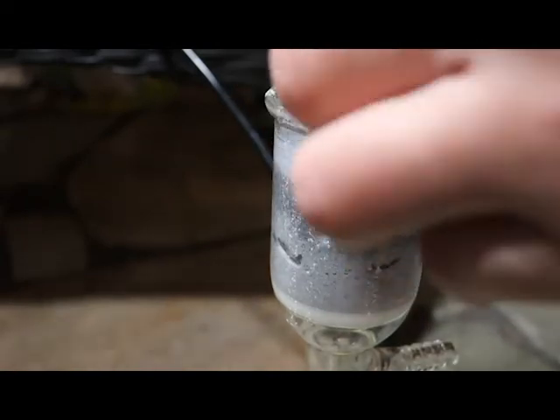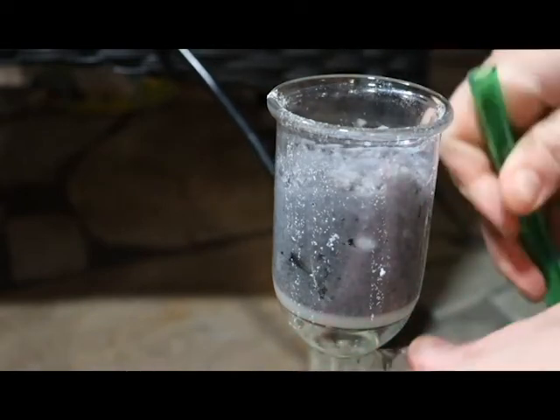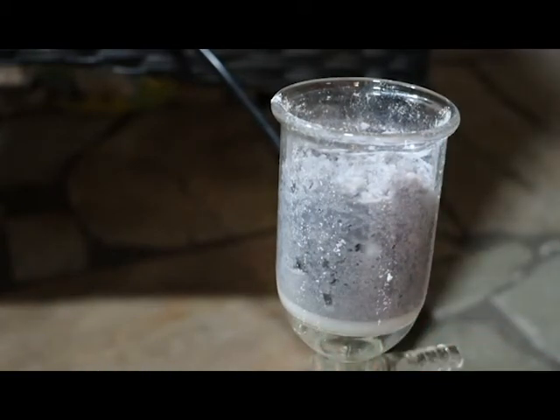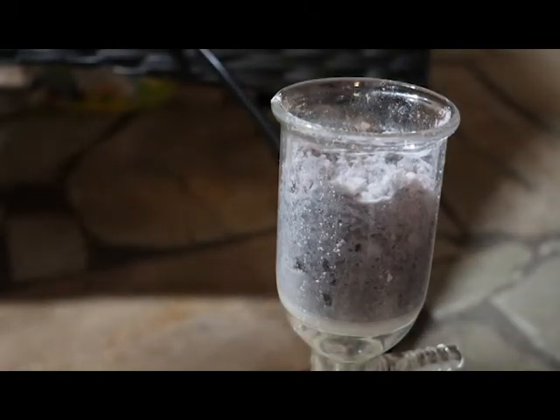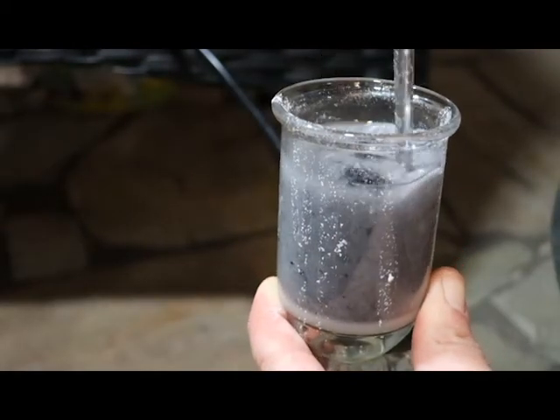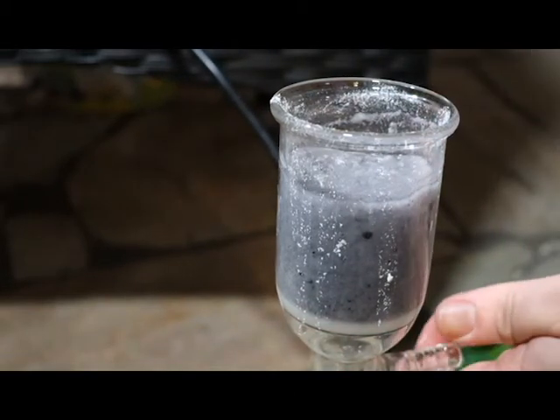As toluene doesn't evaporate that easily at room temperature, and we want to get our product completely free of solvent, we wash it 2 times with 40 milliliters of petroleum ether. Make sure to mix the solid up with the petroleum ether very well, because a lot of times people don't stir around their solid in the filter when washing, which doesn't wash the solid that well.